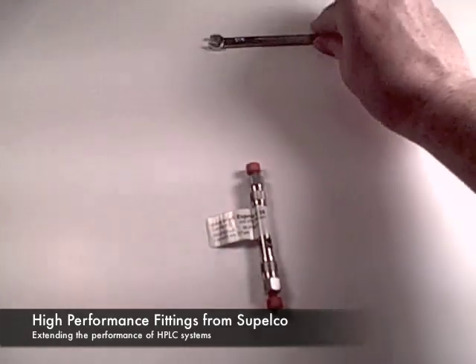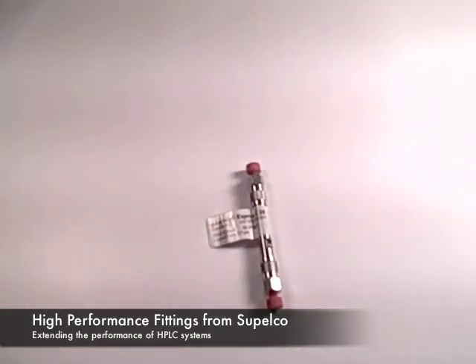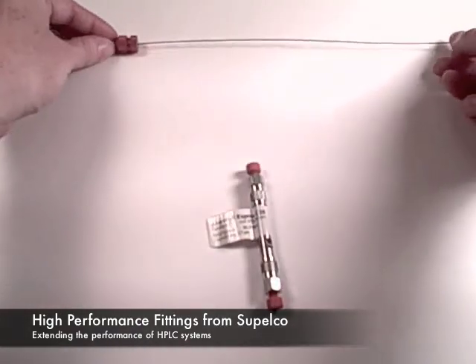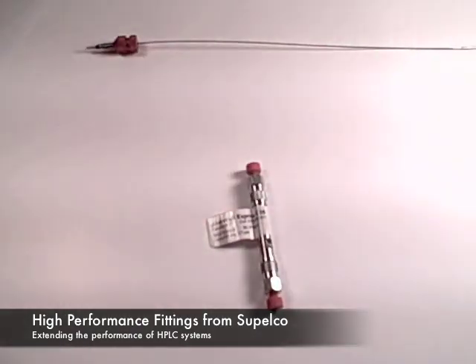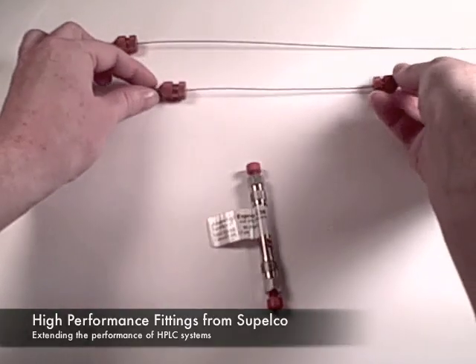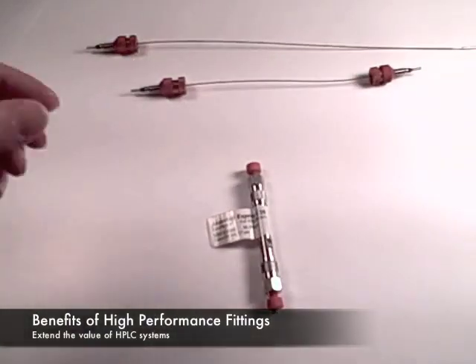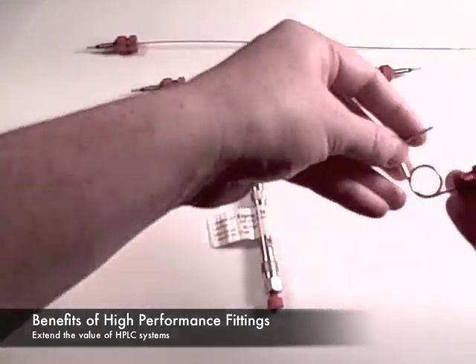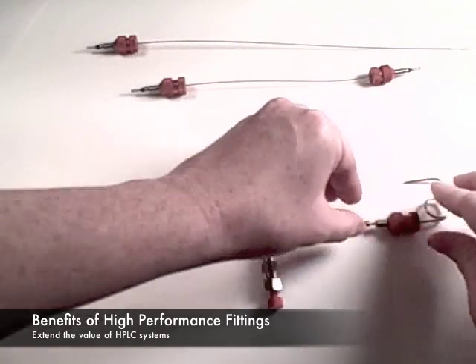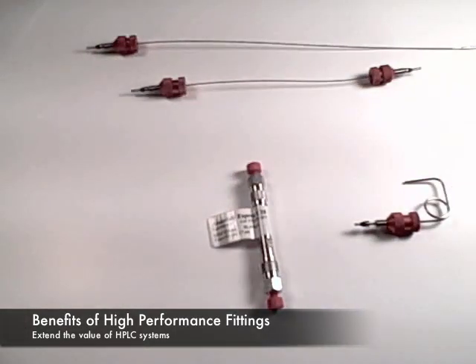Supelco has introduced exclusive high performance fittings and interconnects that are designed to improve the performance of HPLC systems with the ease of use of PEEK fittings. The key benefits of the Supelco high performance fittings are to eliminate dead volume that contributes to peak broadening. They can be used in any HPLC port or any HPLC column. No tools are required with the finger tight design. They are reusable and they are rated at 15,000 PSI.